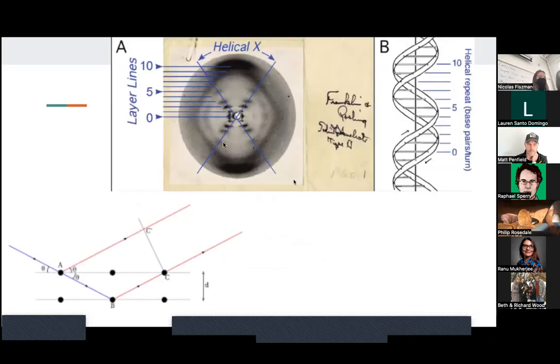When crystallographers examine the diffraction pattern on a computer, they don't get a photo like a regular X-ray. They get a pattern, which you can see right here. So using the raw data pattern, they can calculate the relationship between the atoms. They see basically how close they are together, and they can see the attraction between the two different atoms.